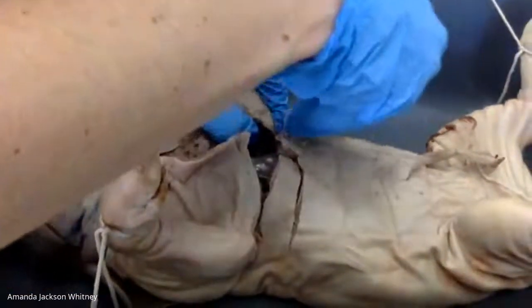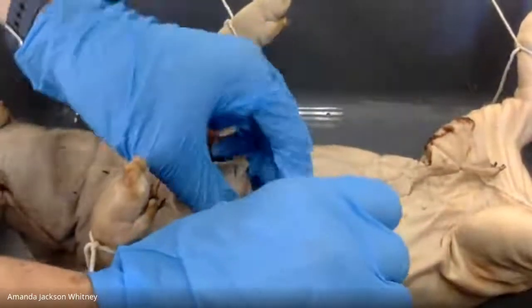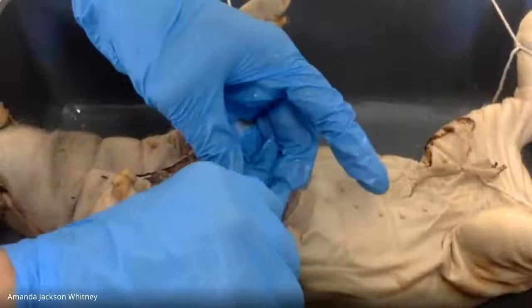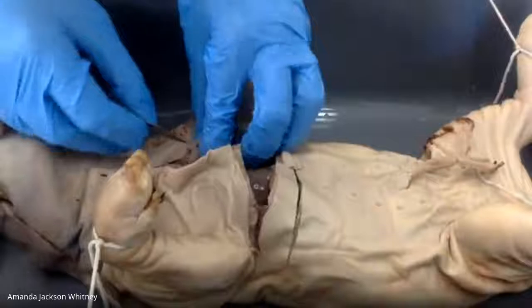And now I am trying to cut down. Good job. You guys can put them off to the side. I'll come get a picture of you guys later if you want. Okay, good.